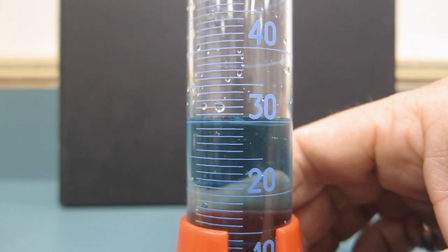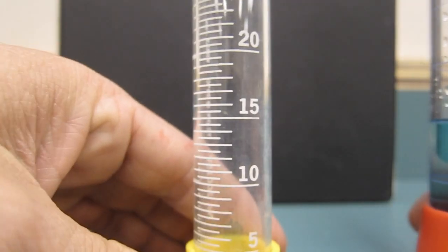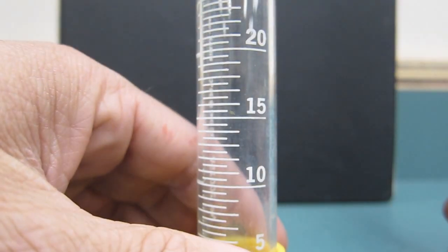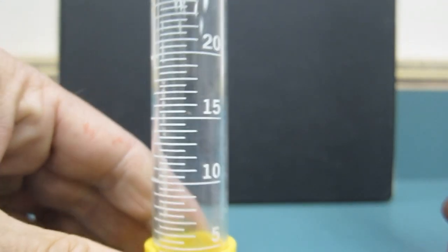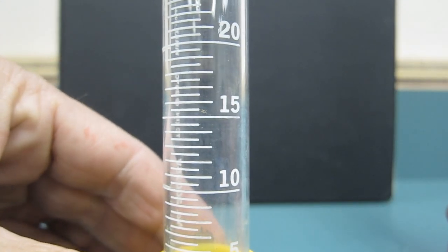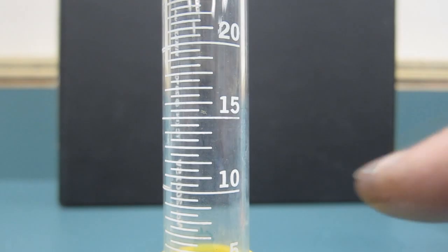Now, that's the 100 milliliter graduated cylinder. The 25 milliliter graduated cylinder... Turn it sideways so you can see it. This is probably the most common one that we use.